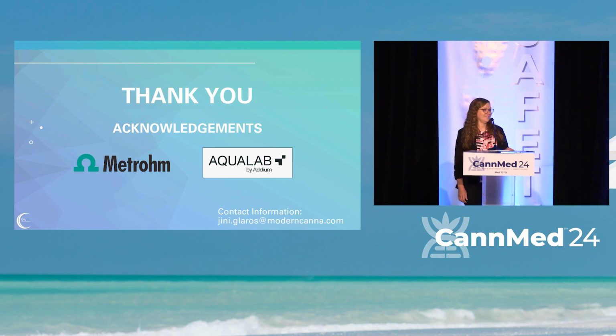Thank you for your presentation. Have you ever considered freeze drying? So we did talk about freeze drying in this and thinking about how that may impact it. However, for a laboratory, most of them don't have freeze drying capabilities. So when we were thinking about this study, we wanted to really focus on what most laboratories could potentially use, and then of course what that gold standard, the Karl Fischer, is.